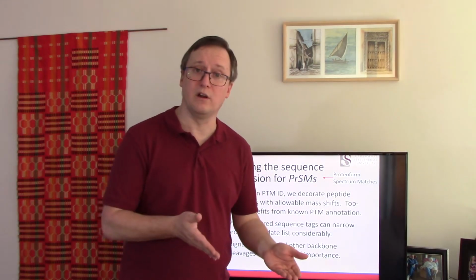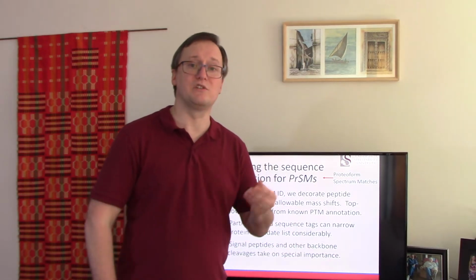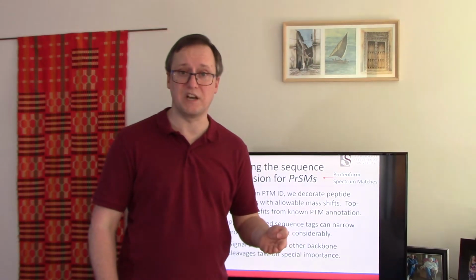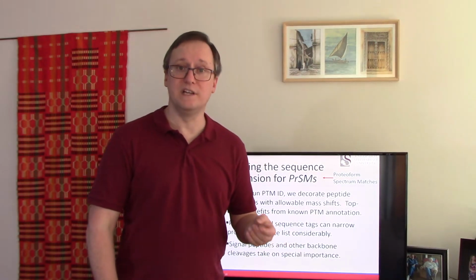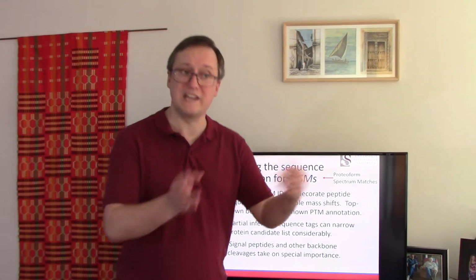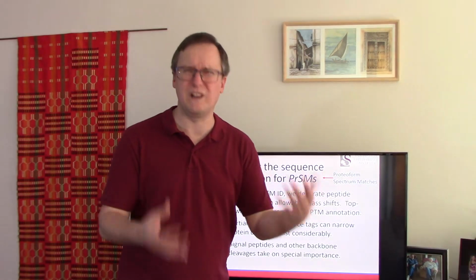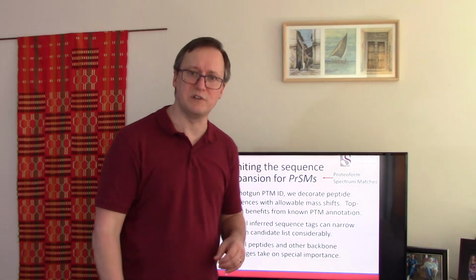They just don't appear in our FASTA sequence databases. So it might be that you're making use of a PEFF-formatted sequence database. PEFF is a format created by HUPO-PSI to pass information like sequence variants and PTMs on the description line of what looks like otherwise a FASTA sequence database.